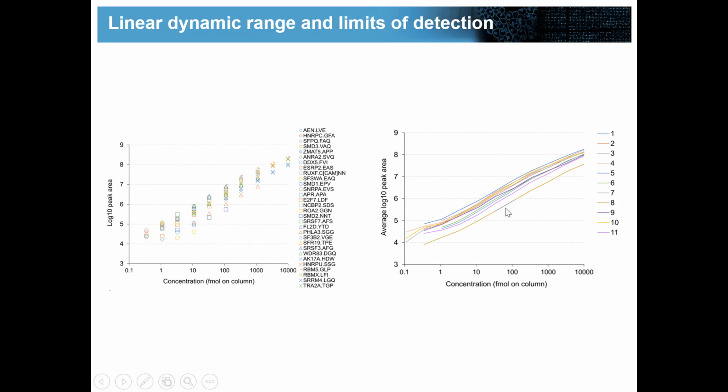There's again an offset in the y dimension, so each instrument has its own response factor, but you can normalize this away without too much difficulty. But we were fairly heartened to see this result that quantitatively all the data was fairly consistent across the 11 sites.